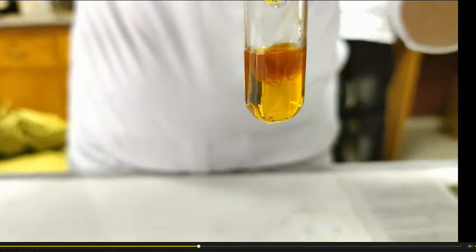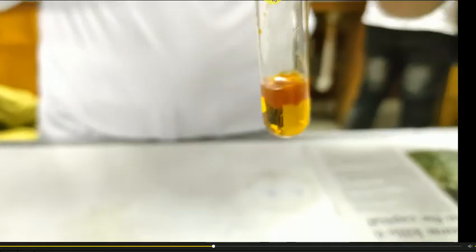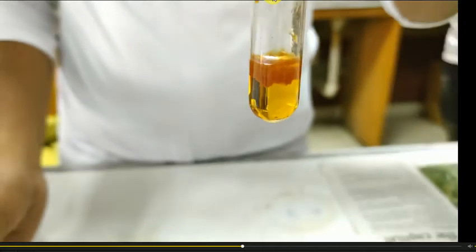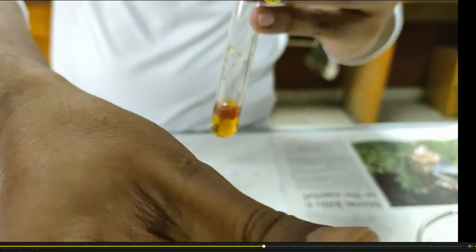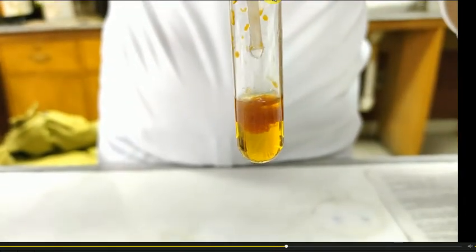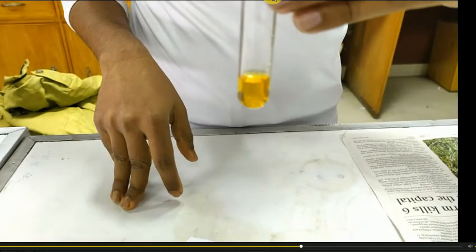In case of alkali, sodium hydroxide, the PPT was wandering throughout the solution, but in case of ammonia, the PPT is floating at the top of the solution. This is also light brown in color, and excess amount of ammonium hydroxide will not dissolve the PPT, and we can see that as the amount of ammonium hydroxide increases, the PPT also increases, indicating the presence of ferric ion.